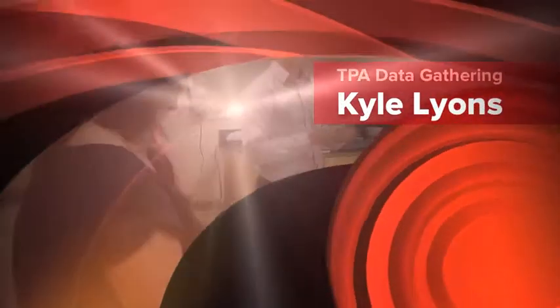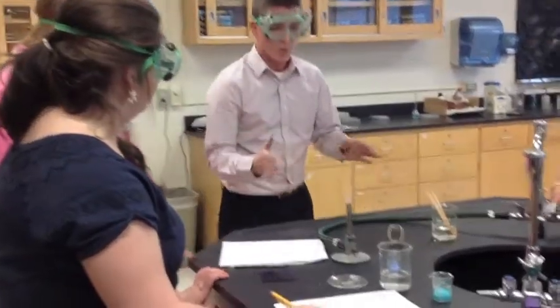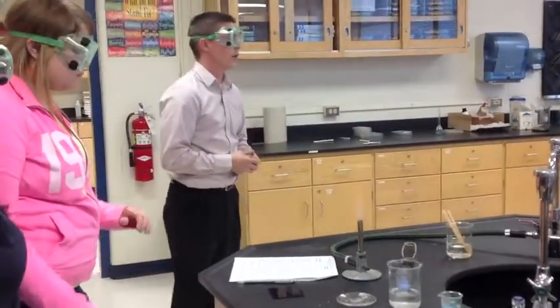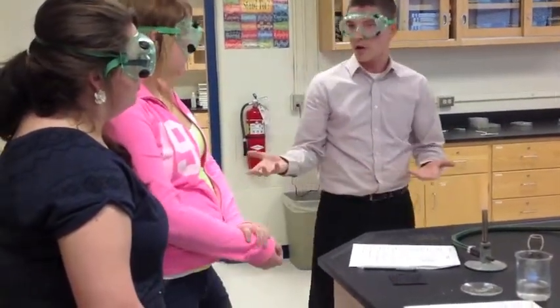Listen, I need everybody's attention. When you guys are finishing up your lab, I'm going to use yours as an example. Once you're completely done, you've got all your data tables filled out, you've figured out your unknown, and determined some type of element that you think it is based on the emission of light that it gives off. So right now, we'll just say that Kayla and Caitlin are complete.